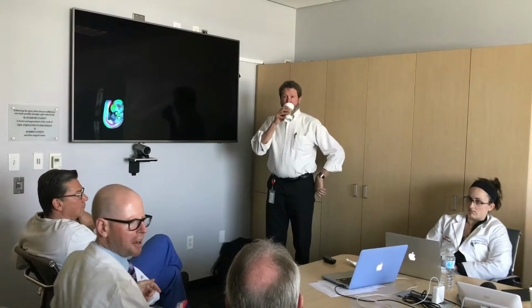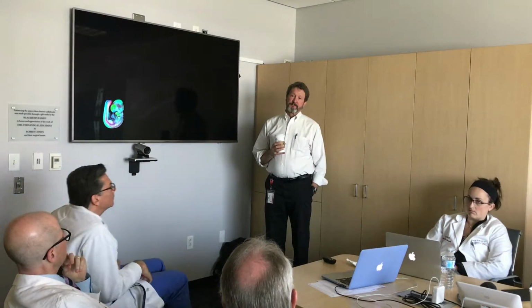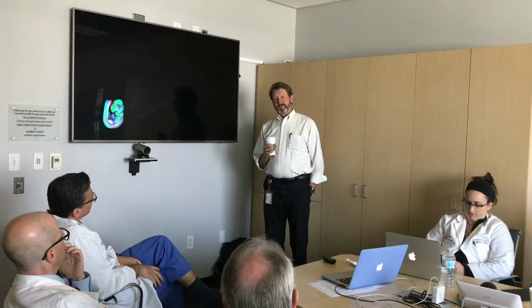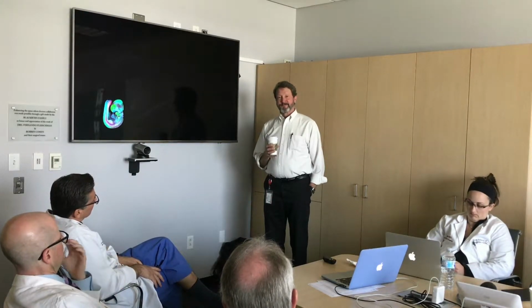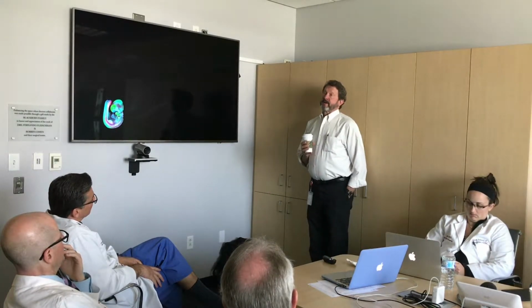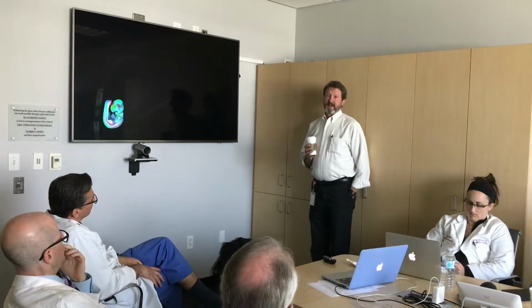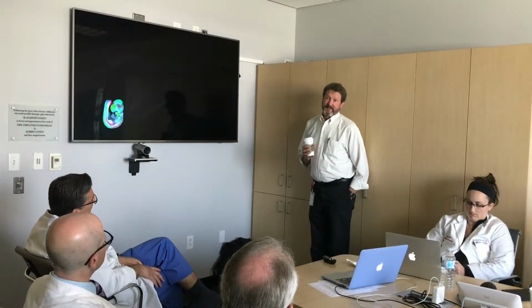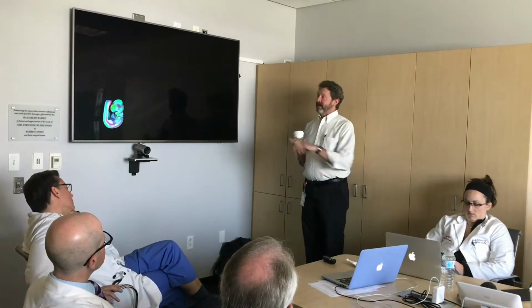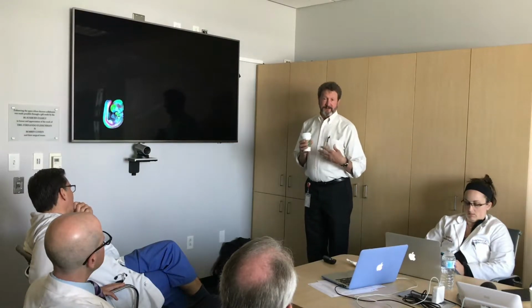Well, I was just going to ask if you have any intravascular applications of this. I mean, you're looking at hollow structures like the bronchus, and let's say the esophagus. Have you looked intravascular, like the aorta, done any work there? We haven't put it up a guide wire yet or anything of that sort. We think it's consistent with that because we can see the lifetime even in perfused tissue. So even in highly vascularized tissue we can see signal.